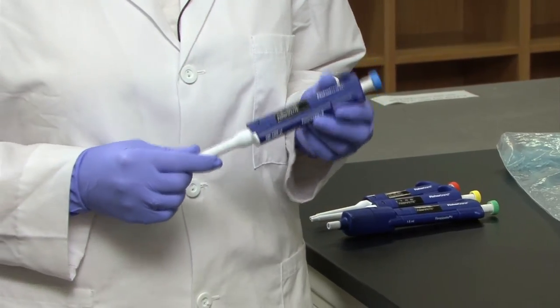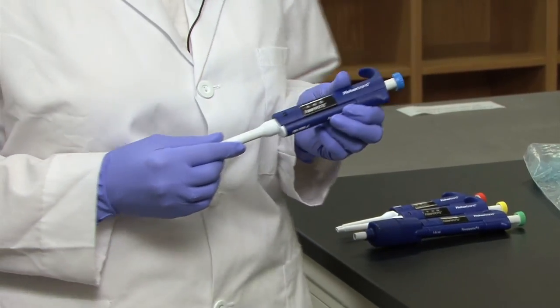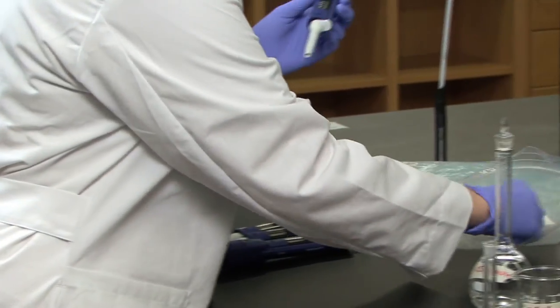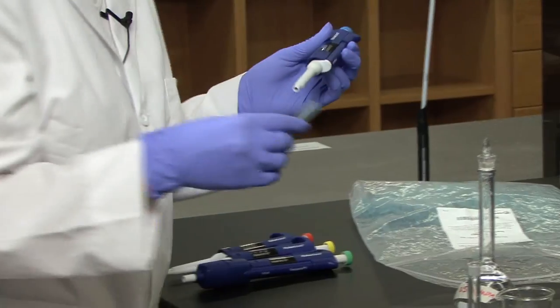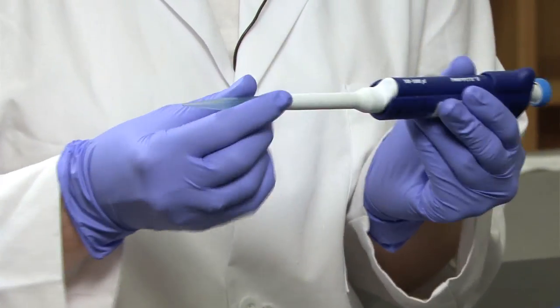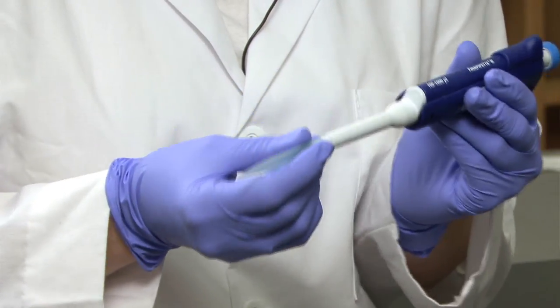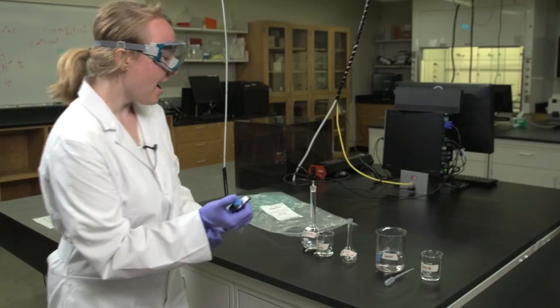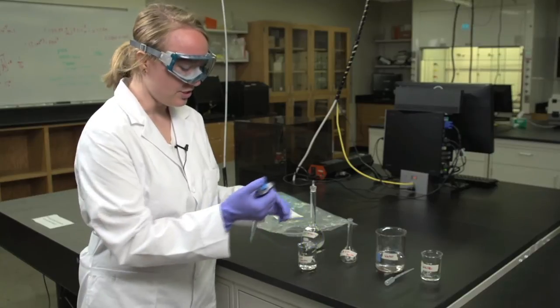You will need to make sure that you get the tip that is appropriate for your pipette. This one uses the blue tips. Slide it on the base of the pipette and push it on firmly. You want to make sure that it is on very firm so that you don't have any leakage of the solution, and then you are ready to transfer your solution.